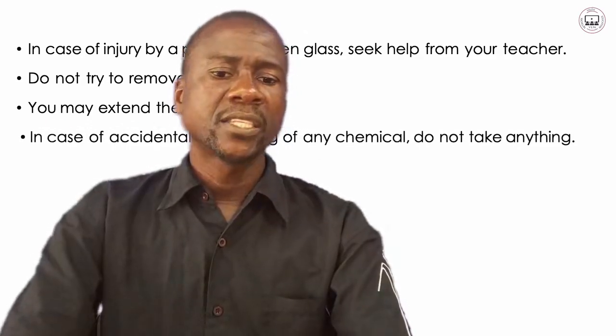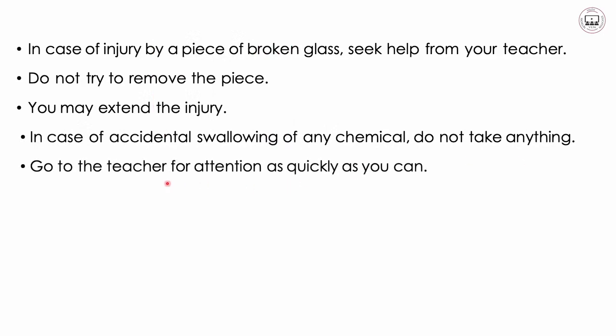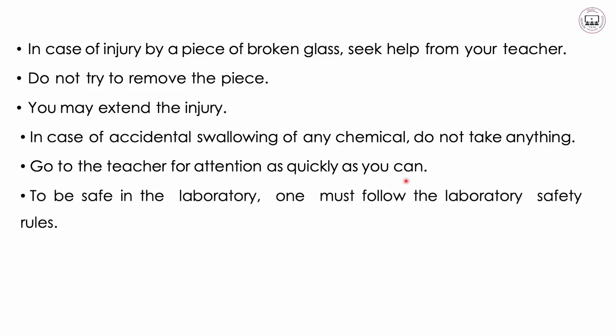In case of accidental swallowing of any chemical, do not take anything, but go to the teacher for attention as quickly as you can. To be safe in the laboratory, one must follow the laboratory safety rules.